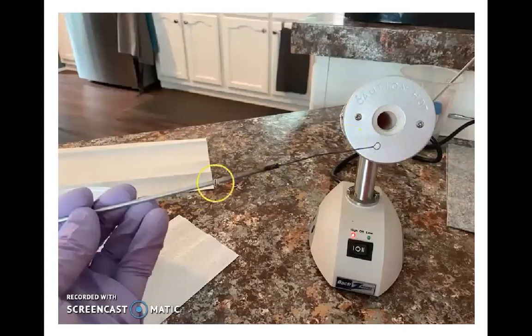So instead, you just hold the loop in your hand and count to about 20. Just do a little mental count in your head to about 20. That's enough time for that loop to cool off to be safe to put into your culture solution.